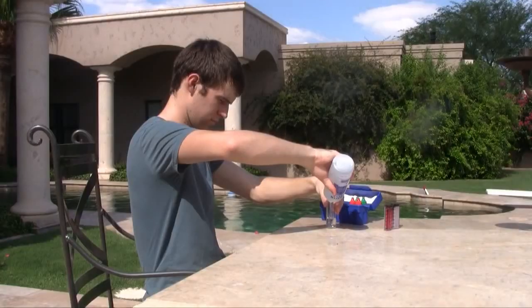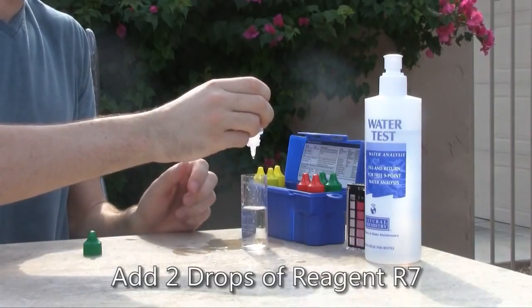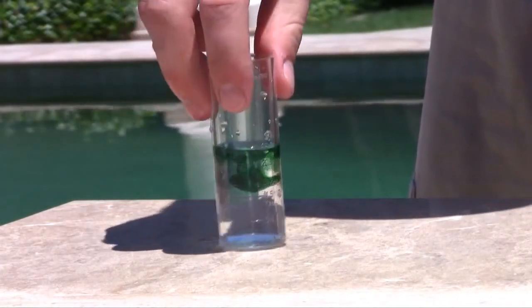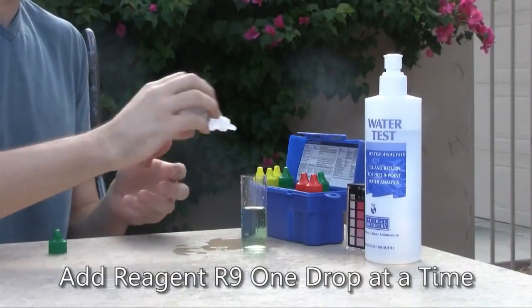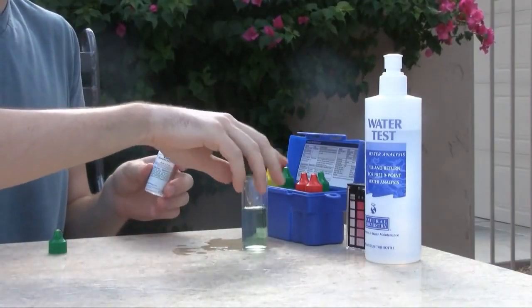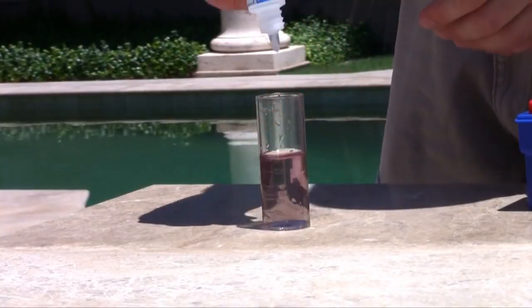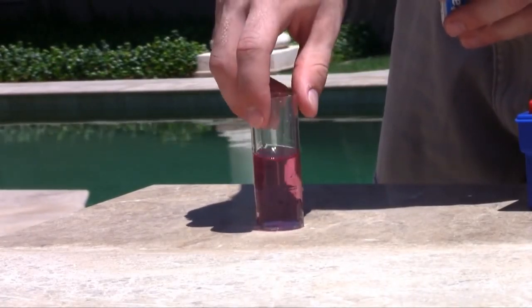Finally, you should test your pool's total alkalinity. Rinse the large test vial with pool water and then fill the vial to the middle line, 25 milliliters. Add two drops of reagent R7 and then five drops of reagent R8. Swirl the sample to mix. The test solution should turn green. Now slowly add reagent R9 one drop at a time, swirling the mixture and keeping count as you go. Stop adding drops when the test solution changes from green to red. The ideal range for most pools on total alkalinity is between 80 and 120 parts per million.